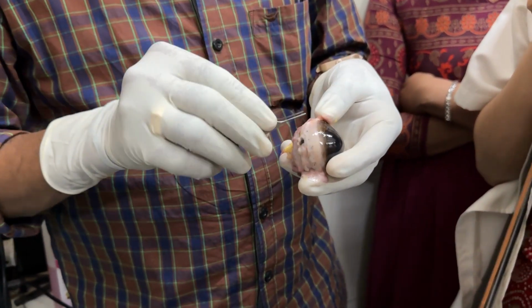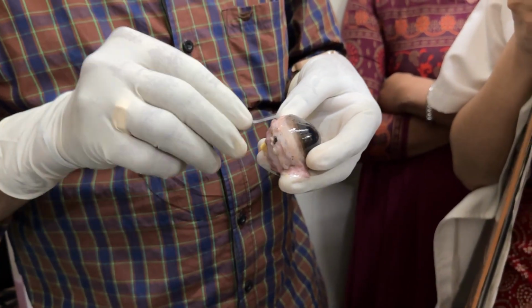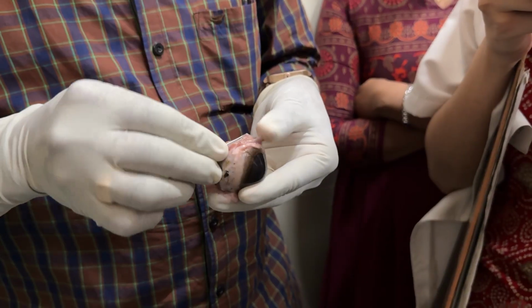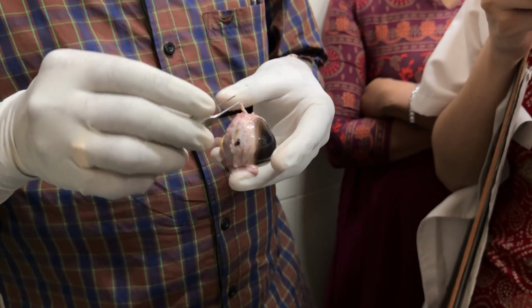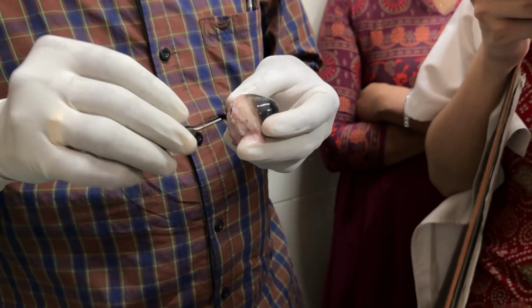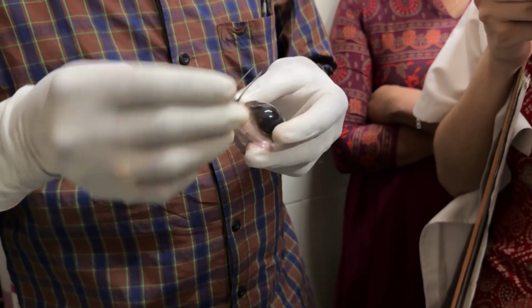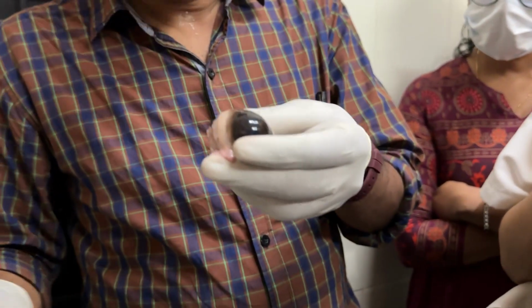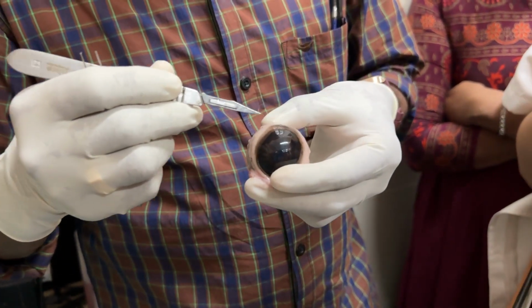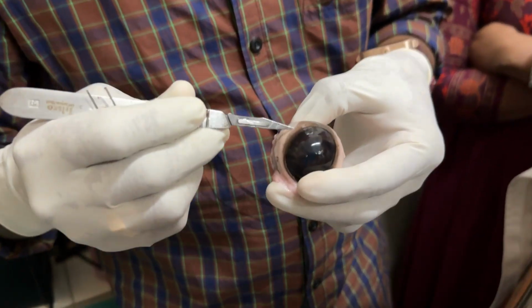So we see, these are the layers, these are the conjunctiva, and the muscles are over it. You can separate it like this if you have time. Now we will dissect it. This is the conjunctival membrane, and this is the cornea. It appears as a plate-like structure, but it's a thin membrane. I will dissect from the junction, the sclerocorneal junction, which we call the limbus.